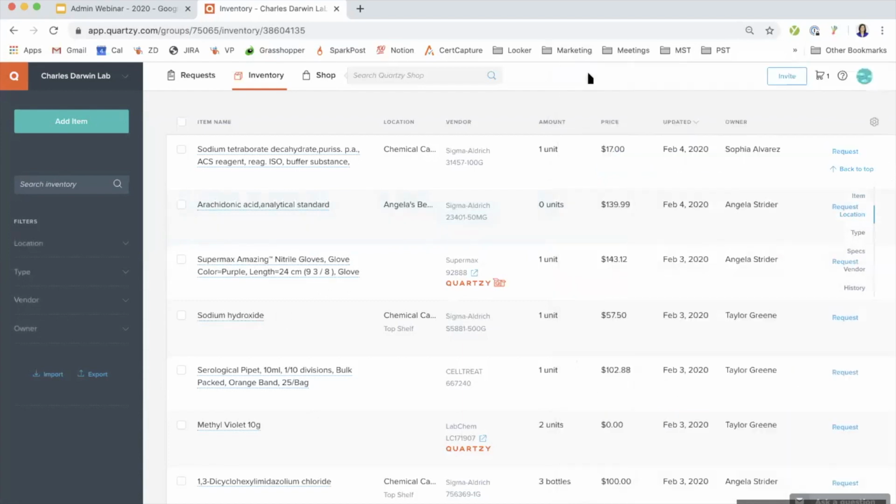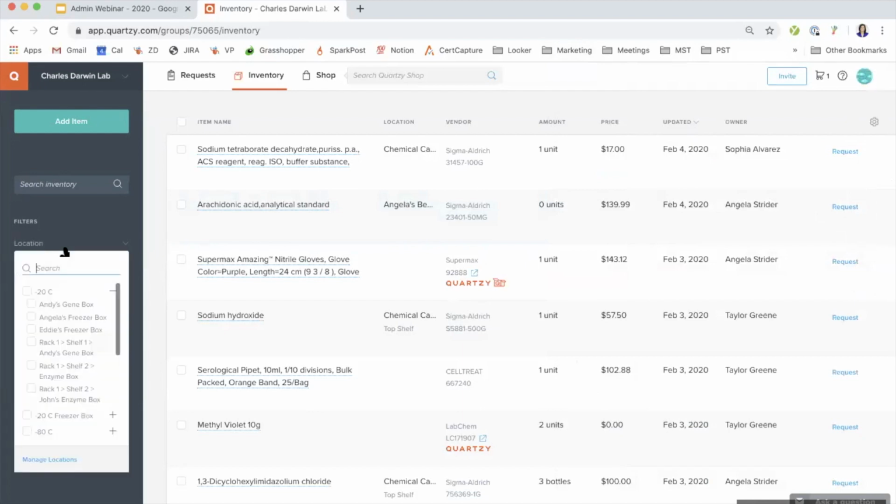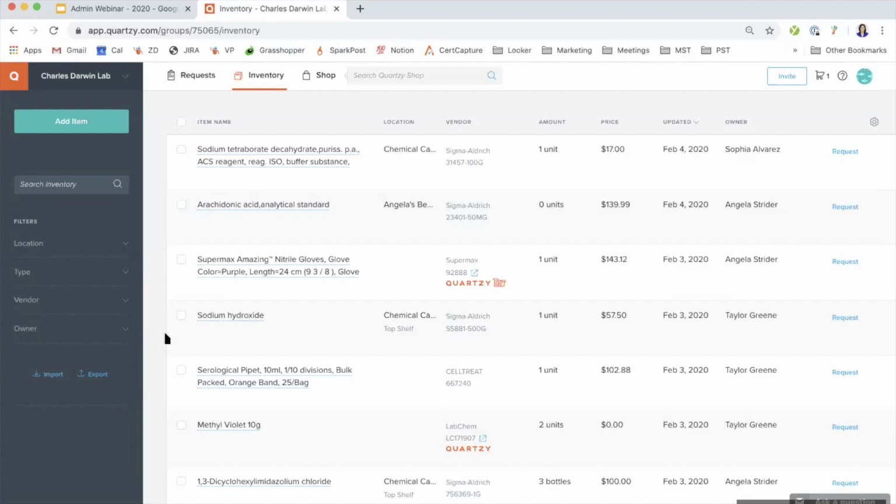And then when you're viewing the inventory, you can filter that location out. So if you don't want to see items that are in that archived location, you can select everything but that location to make sure you're viewing everything you currently have. All right, we can move on and we'll circle back to some of these other questions in the next break.